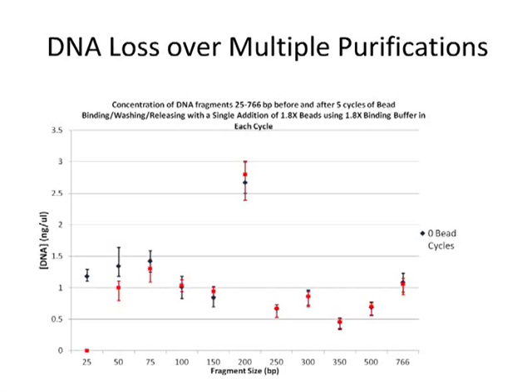And then this slide indicates two things. One is that the purifications can be highly efficient, and secondly, that there are great opportunities with the automated solutions to use very, very low input amounts and retain that recoverability by making slight alterations to the bead protocol.